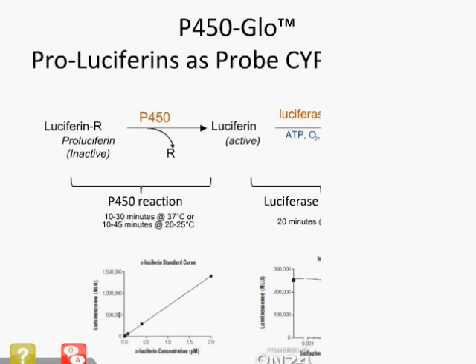The D-luciferin, which is the active form of luciferin, is then detected in the second step of the assay, and this is the luciferase reaction. This part of the assay is accomplished with the addition of what we call the luciferin detection reagent.